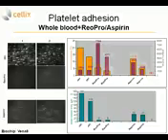taking into account 2 parameters. First of all, it's the surface coverage of all the aggregates, and then the number of aggregates. As you can see in the control sample, where the blood was not treated with anything, there are quite a number of big aggregates. So in this case, the surface coverage is quite big, but the number of aggregates is quite small.